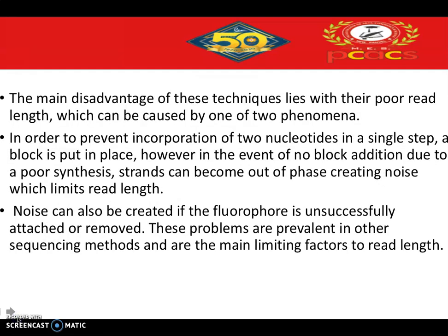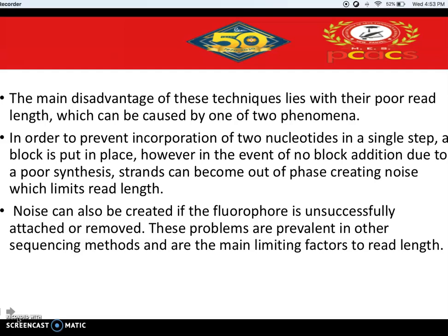The main disadvantage of these techniques is their poor read length. To prevent incorporation of two nucleotides in a single step, a block is put in place. However, in the event of failed block addition, strands can come out of phase, creating noise that limits the read length. Noise — meaning background or unnecessary signals — can also be created if the fluorophore is unsuccessfully attached or removed. These problems are prevalent in other sequencing methods as well, and are the primary reasons why read length is a limitation in next-generation sequencing.